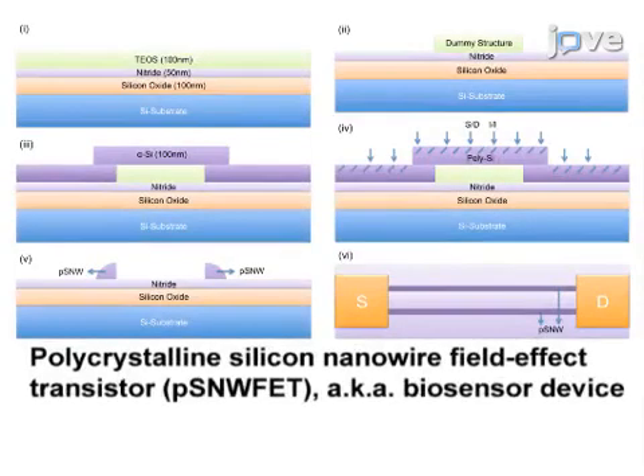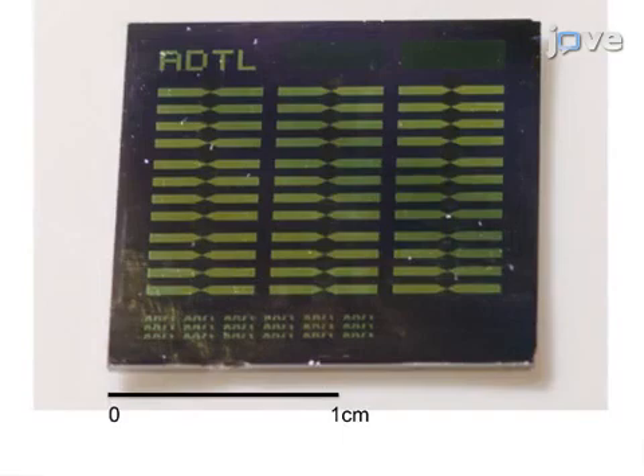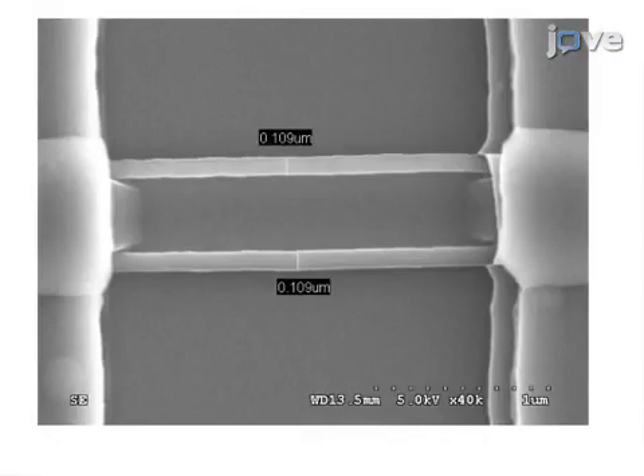The preparation of the polycrystalline silicon nanowire field-effect transistor is covered by the text protocol. The device is formed from a 6-inch wafer. The silicon nanowires on the device are about 100 nanometers wide and 1.6 microns long.